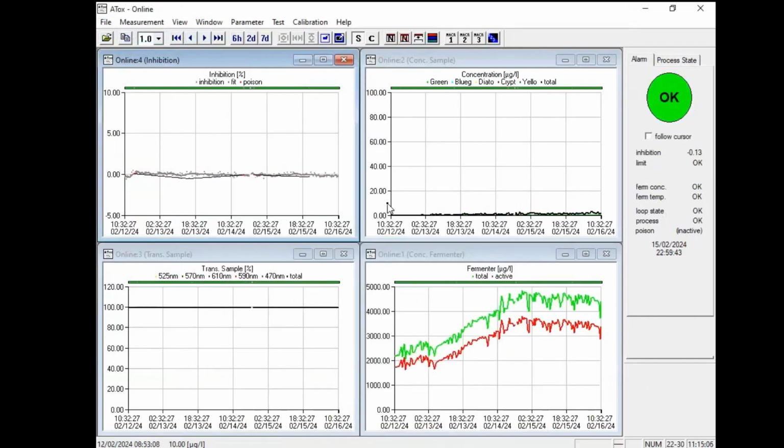With this, it's possible for you to revise the data, and for us, if you have trouble, we can see a lot of what's ongoing. We can produce these graphs, but we also see every parameter of the instrument, from the pump volumes, from the sensor settings, the pump times. Everything is contained because every data point has a data set of the parameters which are used.